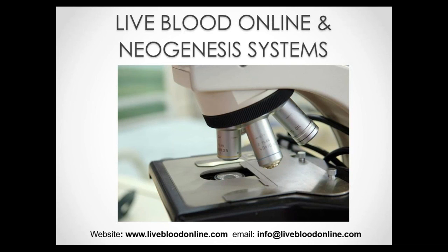Well, in terms of what it involves, it's basically a visual analysis conducted on two blood samples, a live blood sample and a dry blood sample. Now, the live blood part of the test involves looking at the live blood sample under fairly high magnification using two types of applications in microscopy, namely bright field and dark field. The dry blood sample is viewed after the live blood sample under fairly low magnification, looking at the specific patterns of coagulation in the dry sample.